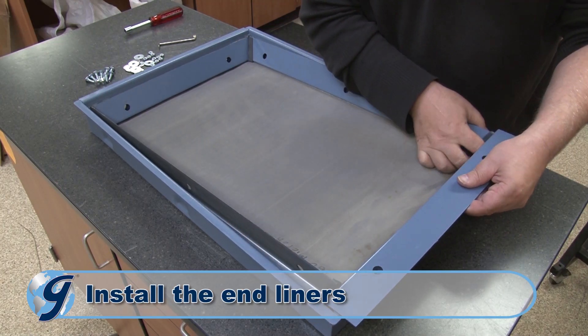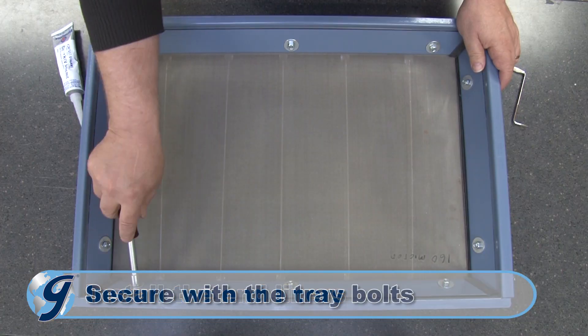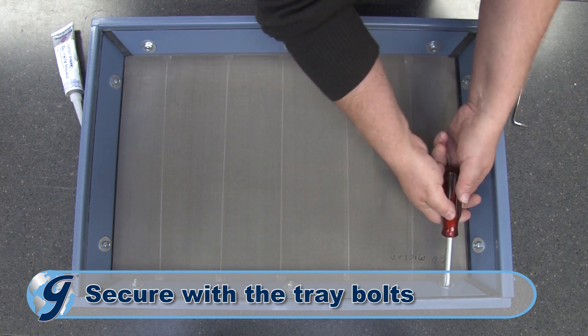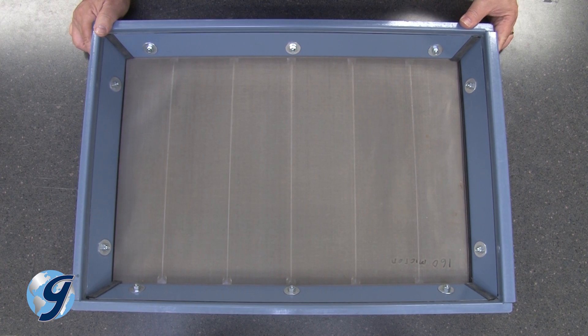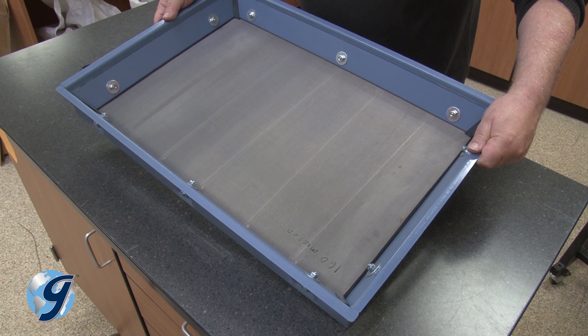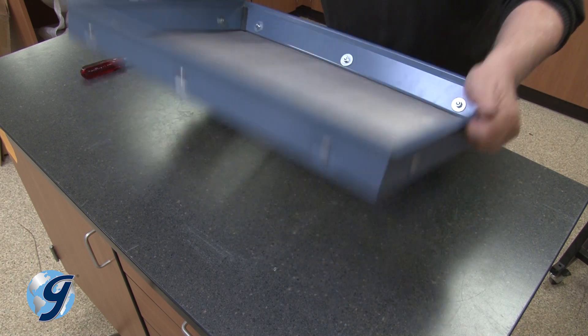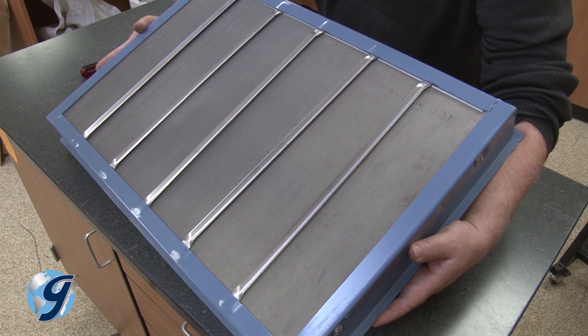Now return the end liners and the deflector, if there is one, and secure with the ten tray bolts. Be sure to position the tray bolts angled up so that the washers and nuts are fully flat against the liners once fastened. As you secure the new fine mesh wire cloth to the screen tray, be sure the wire cloth is flat so that there are no dips or waves in the mesh. Also, be sure the wire cloth supports remain in the notches on the screen tray frame base.